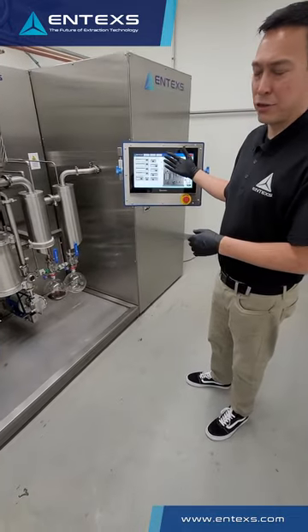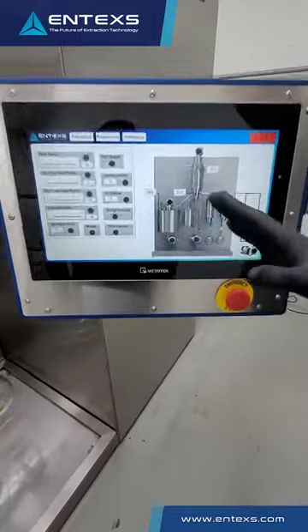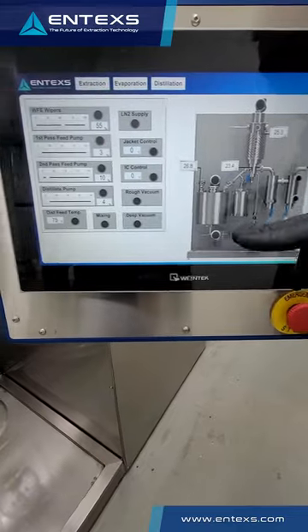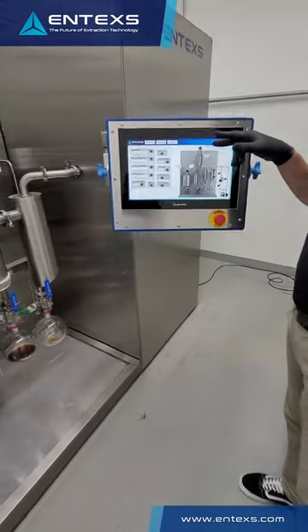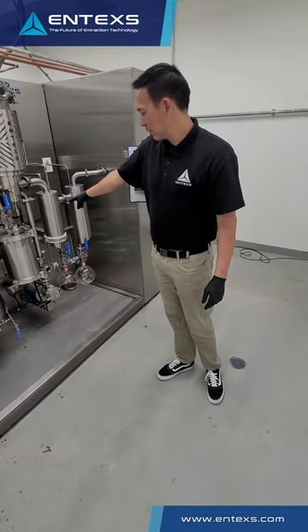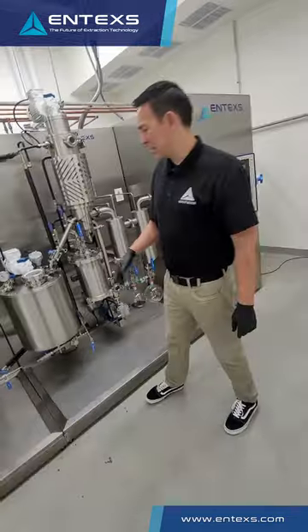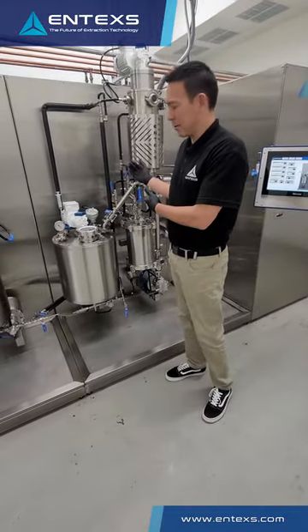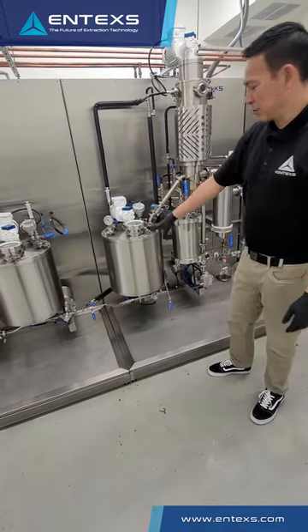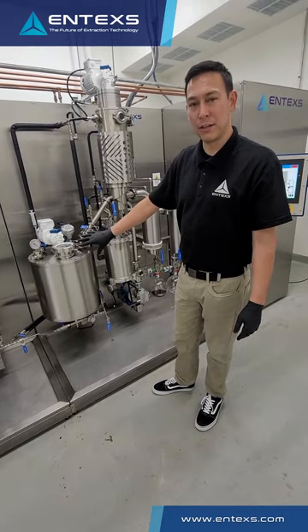This is where distillation is controlled — all touchscreen control. This controls all of your thermal loops. We have multiple thermal loops controlling thermal jackets, condenser temps, jacket temps. We have low-temp cold traps, and all of the lines are jacketed as mentioned. In addition, we have a stirred reactor here that feeds the distillation process. This allows you to keep the product uniform and also pull some of the lights off as it's heated and stirred under vacuum conditions.